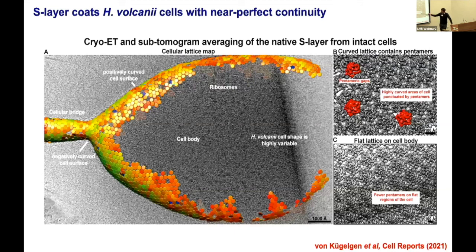I can tell you this species, Haloferax volcanii, is more radiation sensitive than Caulobacter crescentus. Whether that has any physiological meaning, I'm not clear. And Deinococcus radiodurans was isolated at Chernobyl, so it can withstand a lot of radiation. Yeah, there is radiation damage. It's a fact of life. We have to just apply less dose when that occurs.